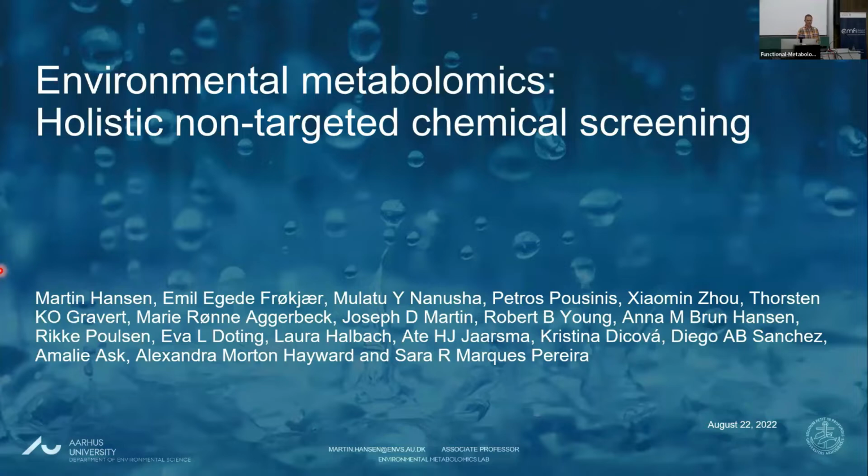So I will just show a few cases that we are working on in the lab. We are using metabolomics and we are pulling it down on environmental studies and using it to detect emergent pollutants, or if something is going on with the metabolism in organisms. And there's a number of people that have been involved and supporting this work, and they have been mentioned here.